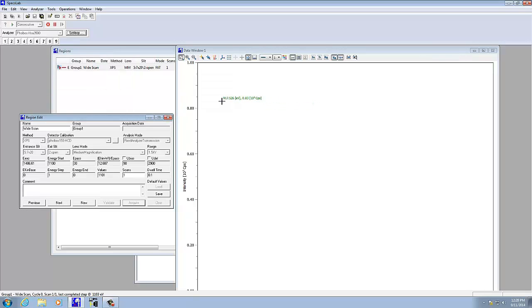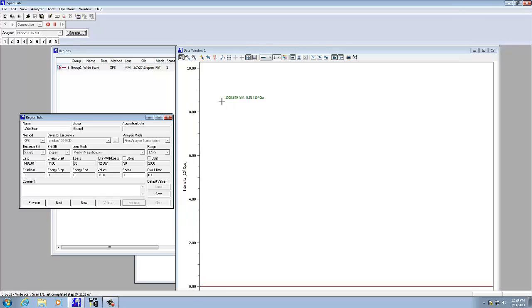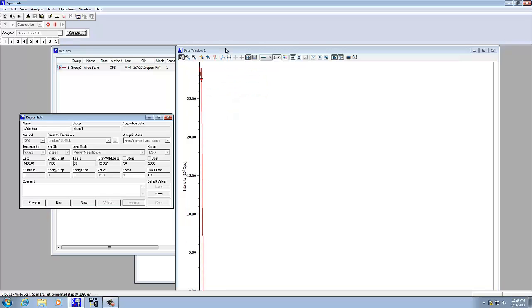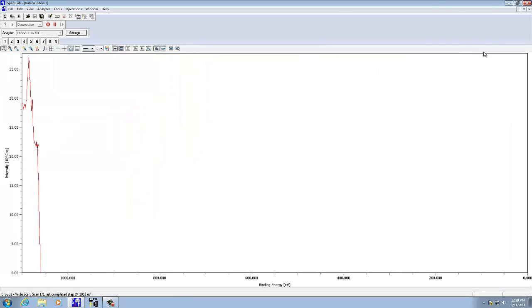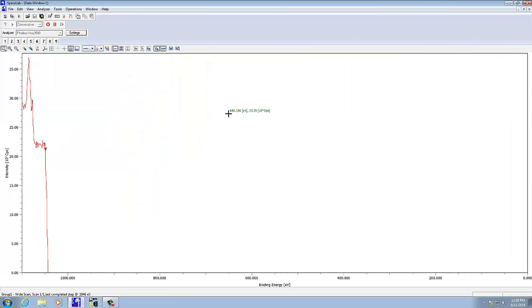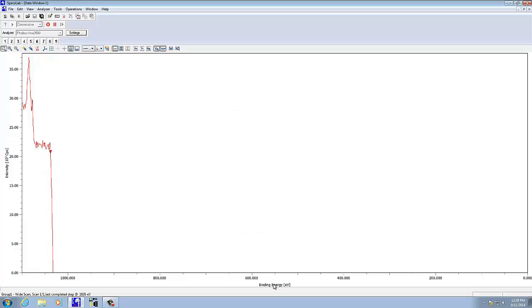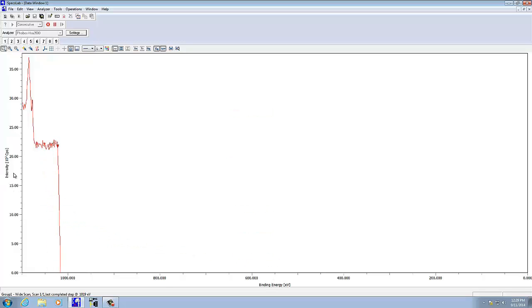Now it is starting to take the data here, and it's going to step through the energy. I'll use the full scale here. It's giving us binding energy on the bottom, and then intensity and counts per second on the left-hand side.